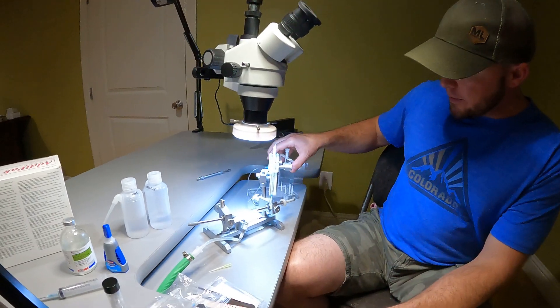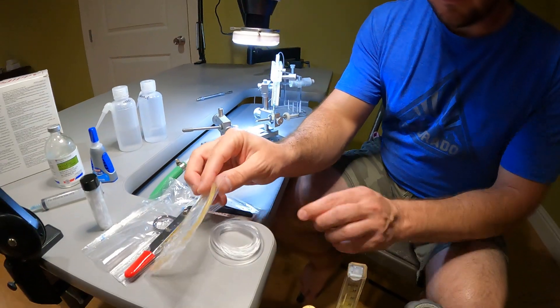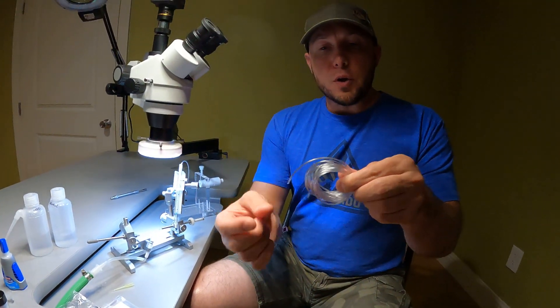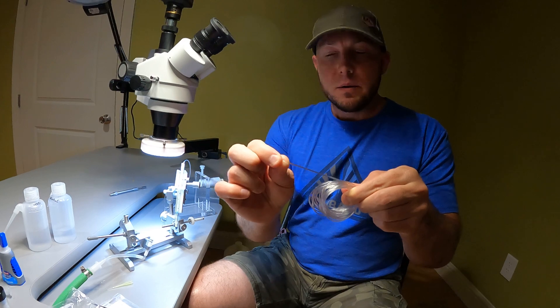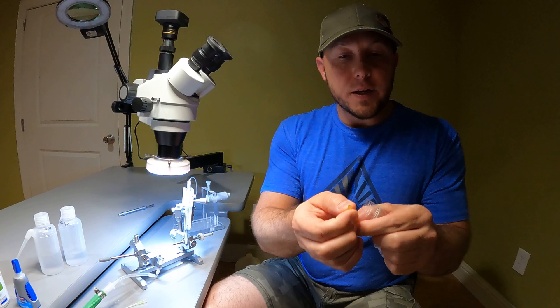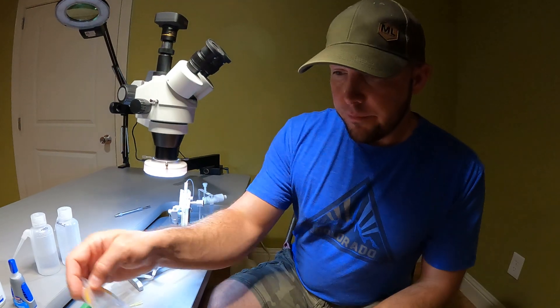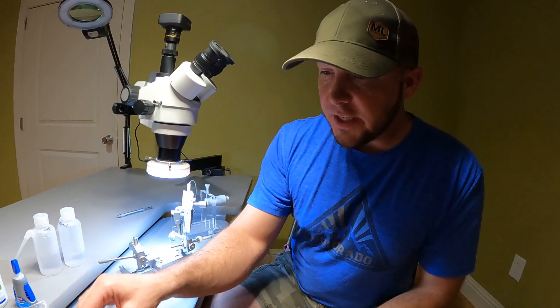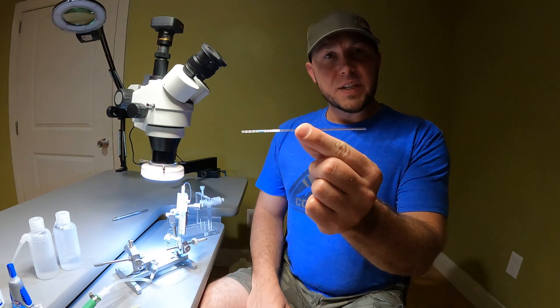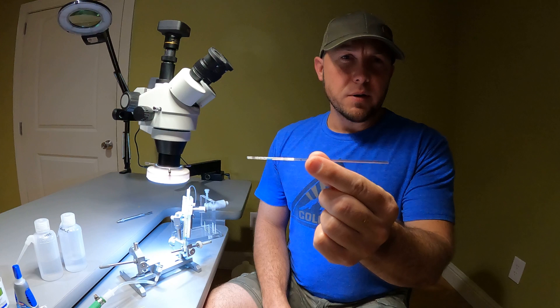The tubing I use in between the syringe and capillary tube is small, flexible, clear tubing. I use a bit thicker rubber tubing to connect everything together — the capillary tube, the tips, all that. Here are the capillary tubes I use. They hold about 100 microliters or so of semen, and that's enough to do at least 10 queens.